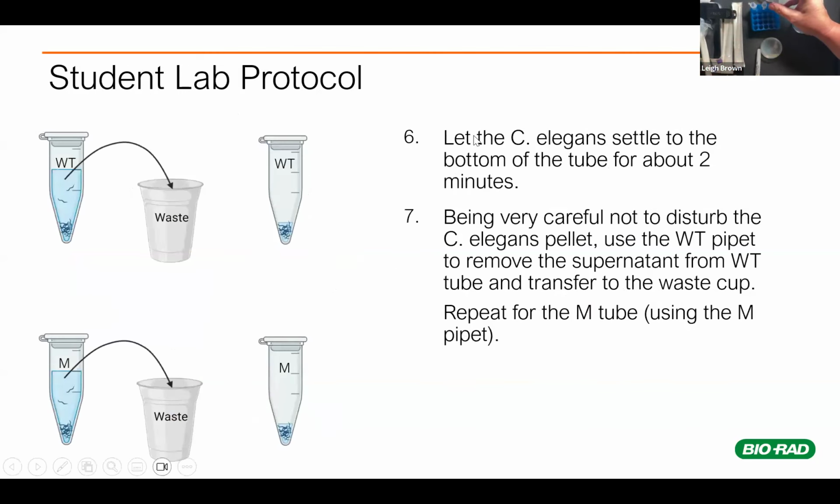Those will now sit upright for about 2 minutes. Like I said, if you've got a rack to put them in, great. But if you don't, just hold on to them in your hands, and that will work just as well.